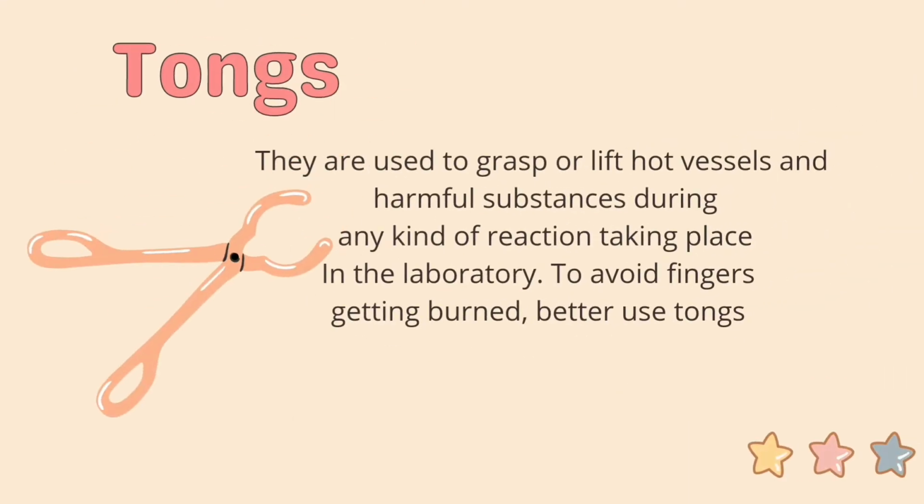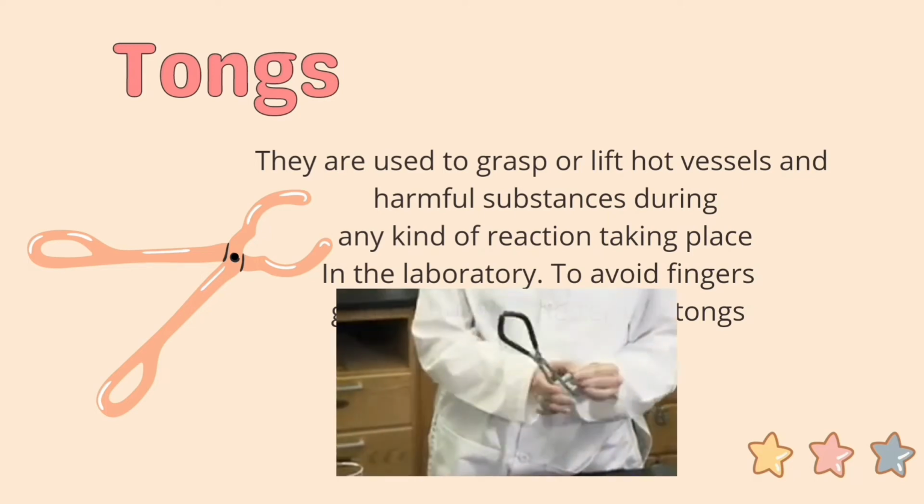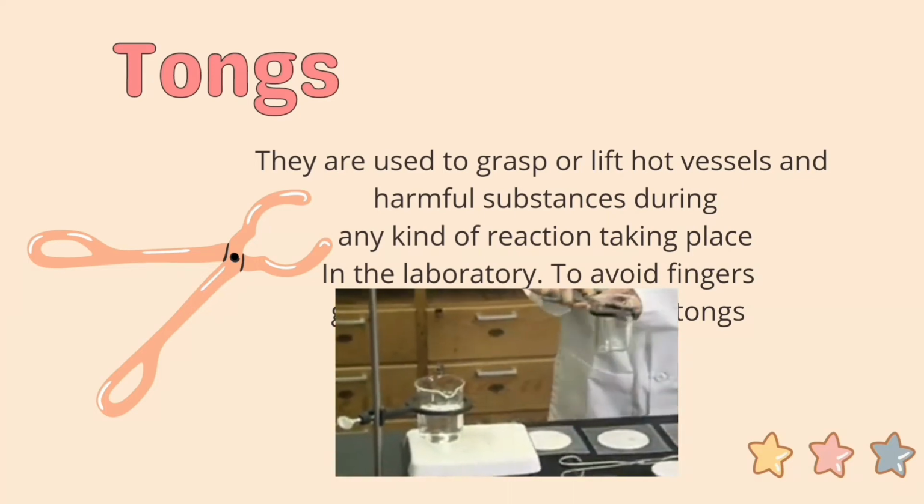Next are the tongs. Tongs are used to grasp and lift hot vessels and harmful substances during any kind of reaction taking place in the laboratory. To avoid fingers getting burned due to careless handling of hot or dangerous substances, better use tongs.